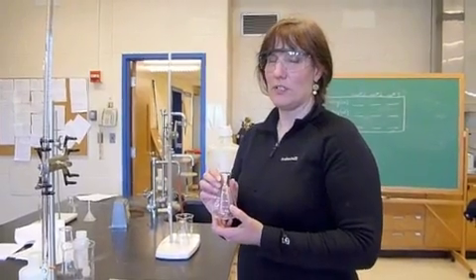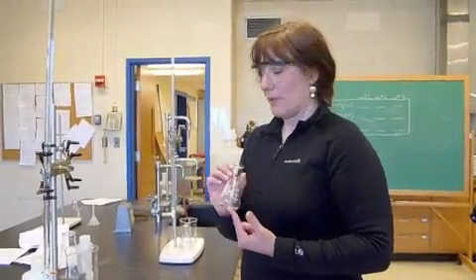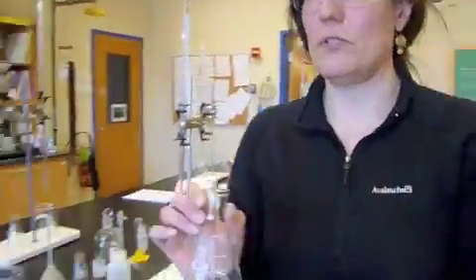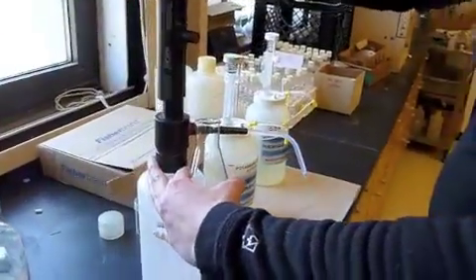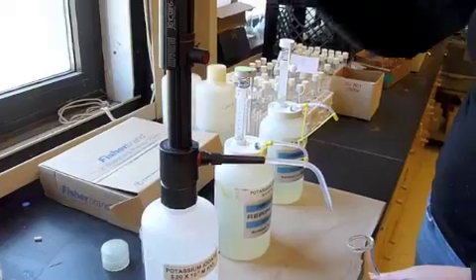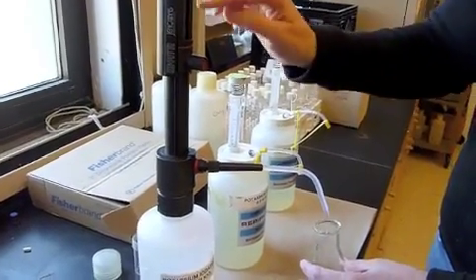I'm going to take my 125 milliliters Erlenmeyer flask, and I'm going to walk over to this re-pipet situation. This is potassium iodate. You pull this up, it will immediately put out whatever it's set for. This is at 10 milliliters, so that's what I need.